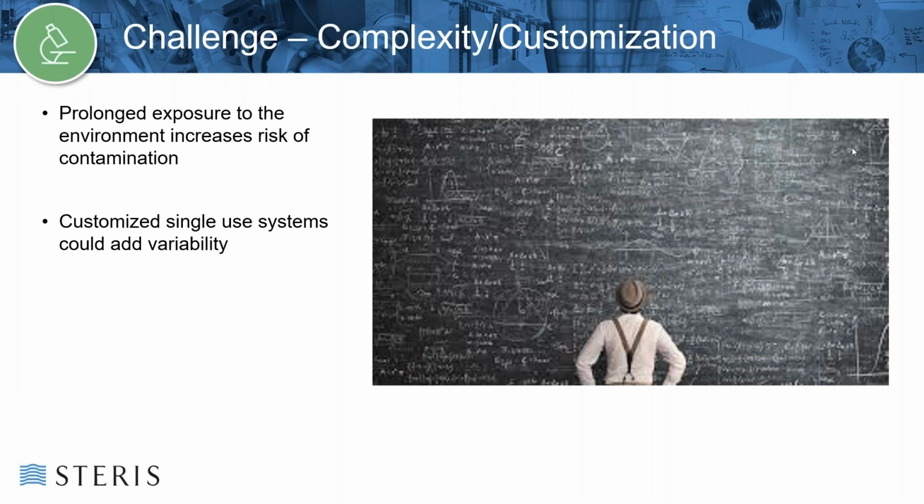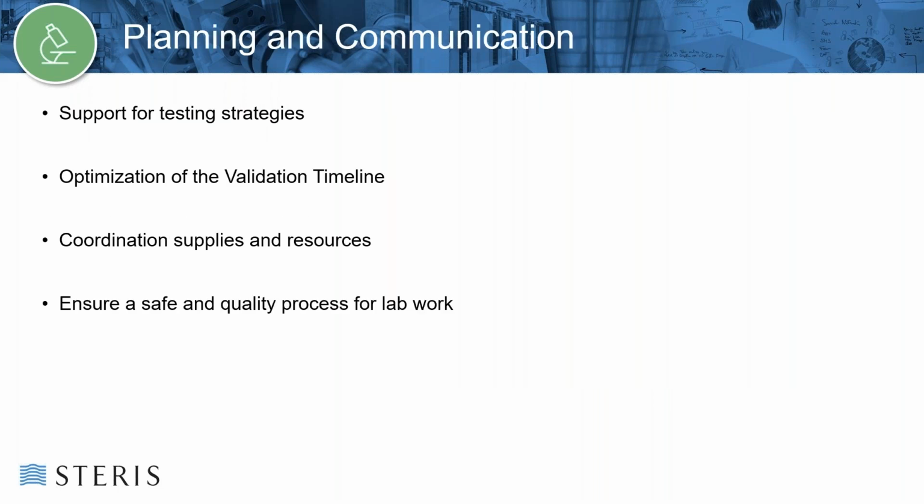Complex systems can take additional time to fill or disassemble. This can affect the amount of time that the samples could be exposed in the clean environment, and the manipulation that needs to be performed to the test sample, increasing the potential for incidental contamination. And those customized single-use systems could add variability to the sterilization process and may require the creation of the simulated worst-case product that represents various configurations of the device.